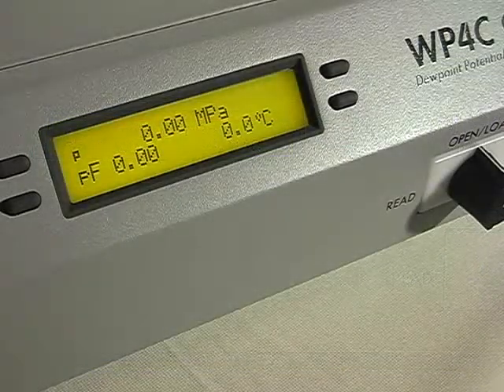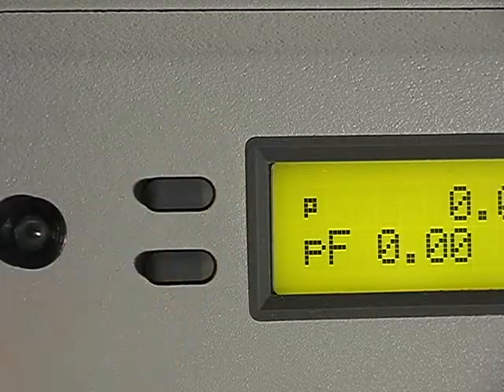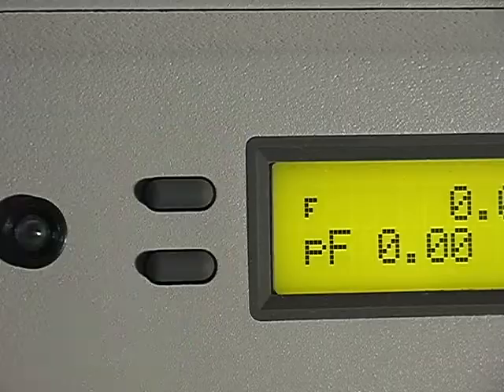Most users can use precise mode all the time. With samples wetter than minus 0.5 MPa, you may achieve better results using continuous mode. If you are measuring extremely dry samples, fast mode may improve your reading slightly.